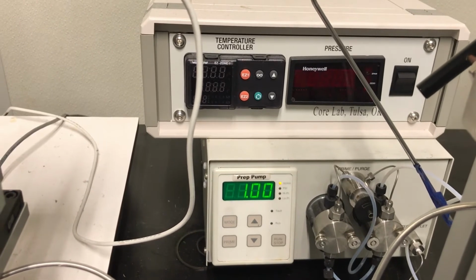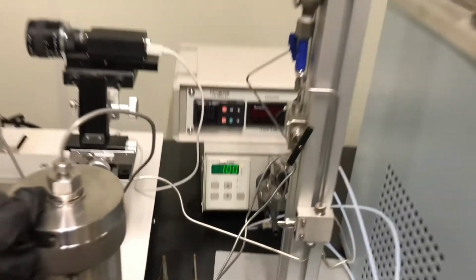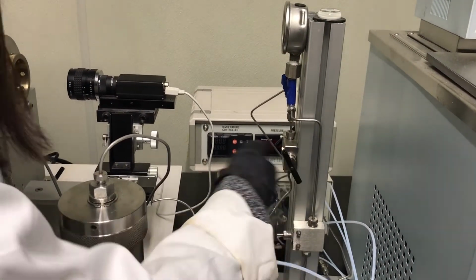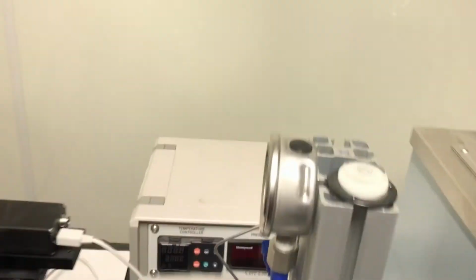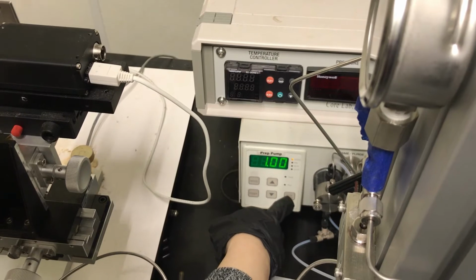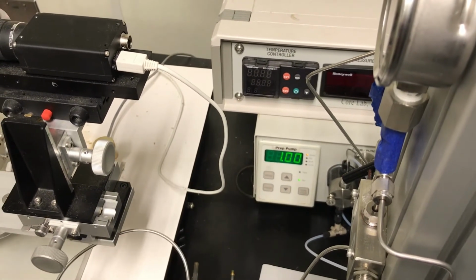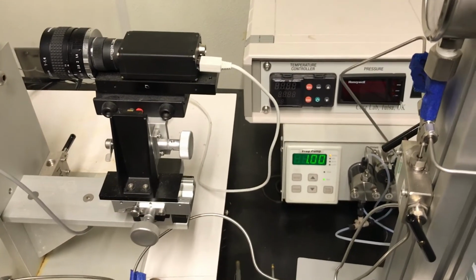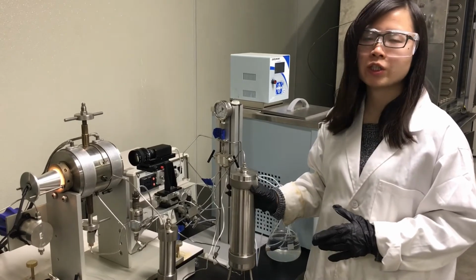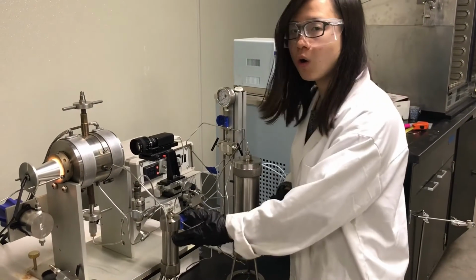Okay, first we check, this valve is used to inject the water, so we open this one and then adjust this injection rate, and then you push the run, and then we will start injecting the water. Okay, after we finish injecting the water, we may need to follow the same procedure to inject the oil phase.